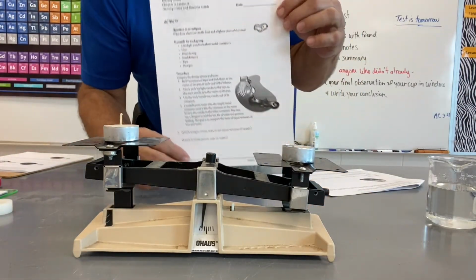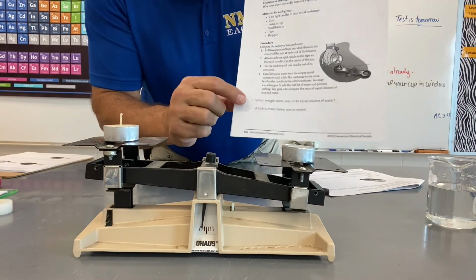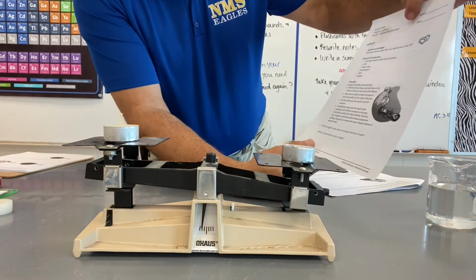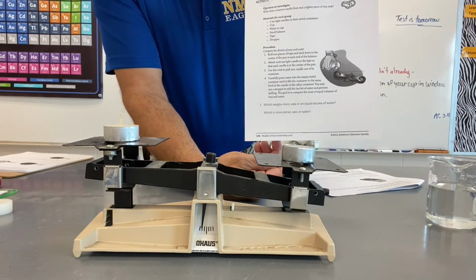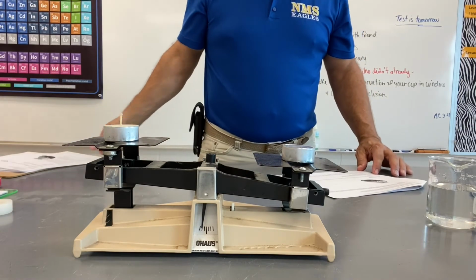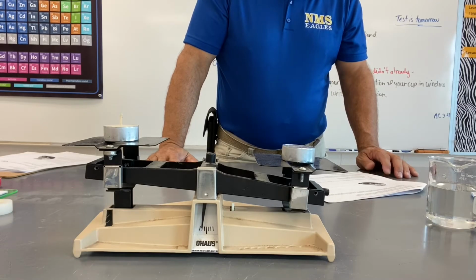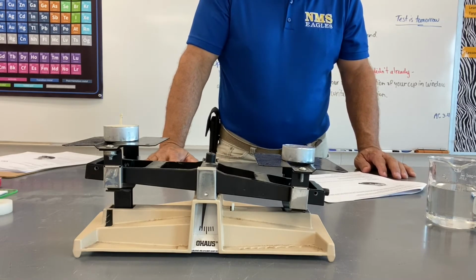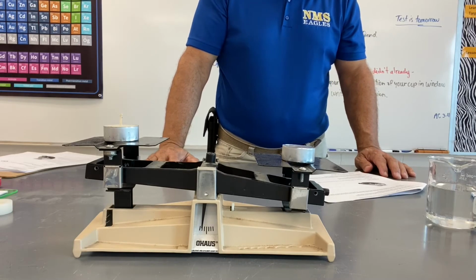All right, so on your student activity sheet, you have questions as you get down towards the bottom here. And the question is, which weighs more, wax or an equal volume of water? So now you should be able to answer that question. What I need you thinking about is which is more dense, wax or water? So which weighs more and which is more dense?